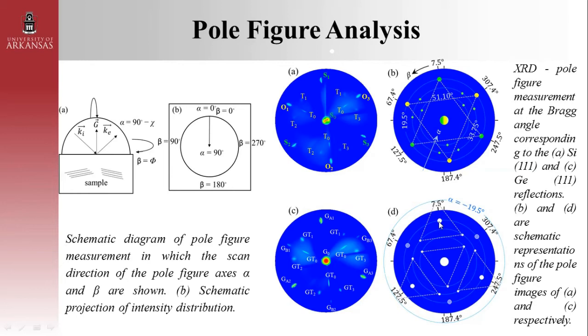Okay, so basically we identify two types of reflections, namely rotational twins and reflection twins, and this is on a global scale. And so basically we will try to quantify these results and try to see the consistency of this result by using TEM.